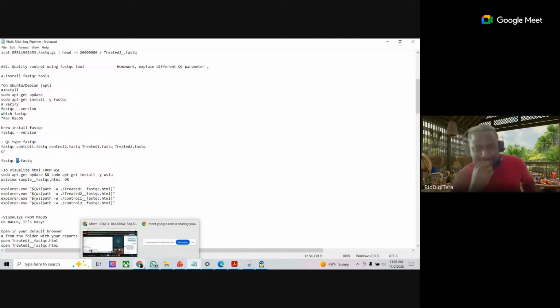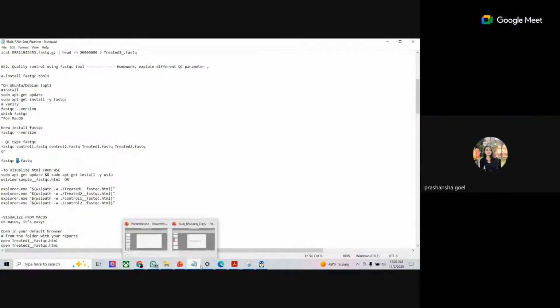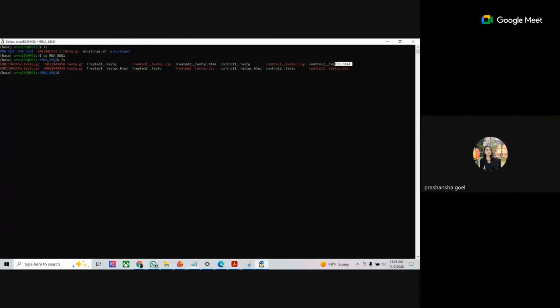Okay. What happened? I think I downloaded it, I ran the commands provided by you, but somehow these files didn't download properly or something else.